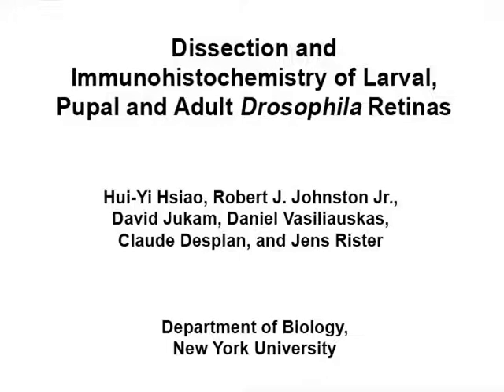The overall aim of this procedure is to obtain optimal dissections of Drosophila retinas and to visualize proteins expressed in the developing retina.